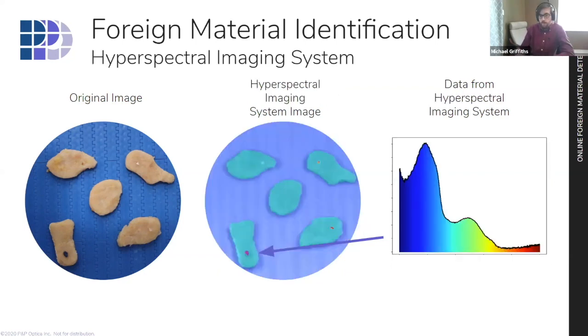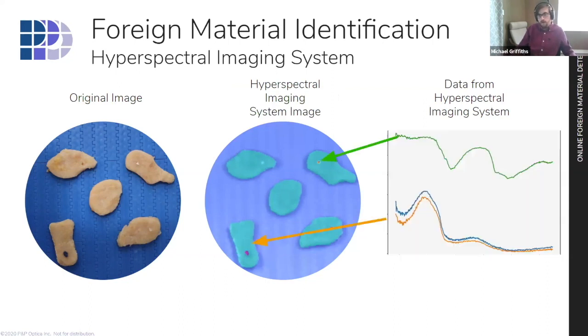So this is where hyperspectral imaging begins to excel, in that you're filling in all these missing gaps of information and producing the continuous spectra for what is being seen, in a way seeing the chemical signature to its full extent. So looking at what this would be viewed like, here we can see in green the spectra of one of the plastic objects and the orange line representing chicken. There are very large differences between the spectra, which is immediately obvious at first glance.